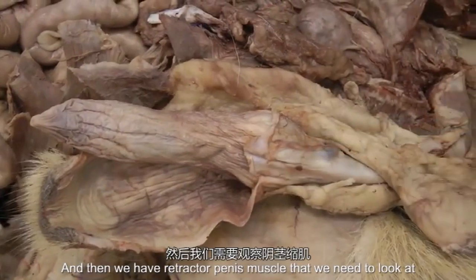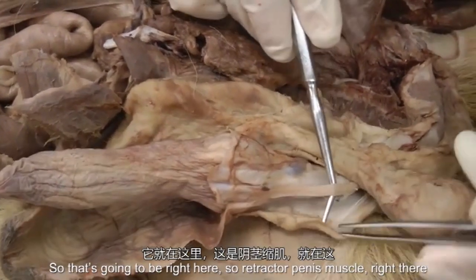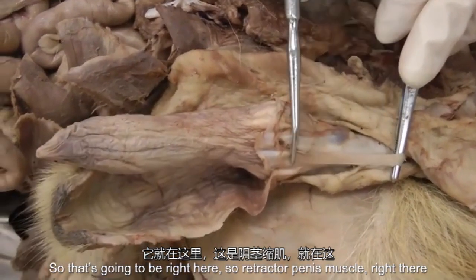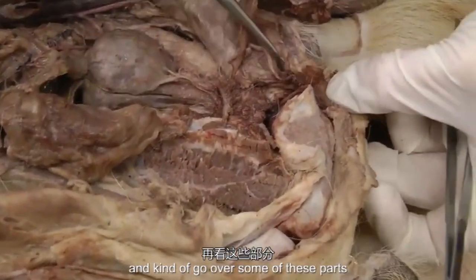And then we have retractor penis muscle that we need to look at. So that's a ventral midline structure here. So that's going to be right here. So retractor penis muscle, right there. And then we'll move back up towards the root of the penis and kind of go over some of these parts.